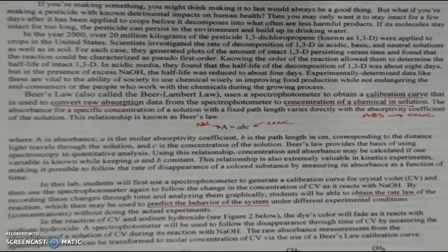Okay, guys, there seemed to be a lot of confusion on what the point of this lab is. You're trying to make sense of it, so I'm going to try to clarify some of this stuff, and what the two graphs mean. First of all, in the introduction, the background information from the lab, if you read right here, it talks about Beer's law.